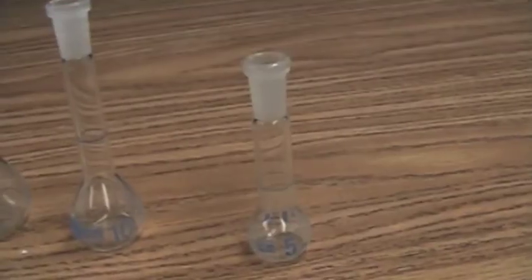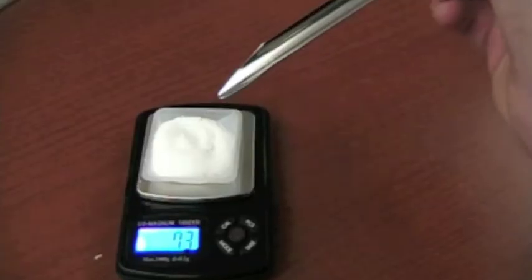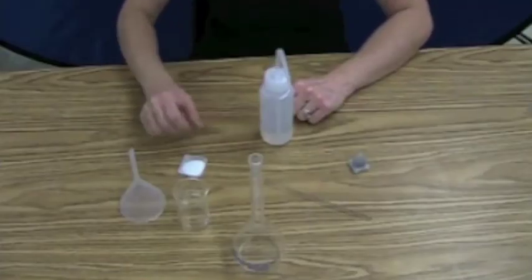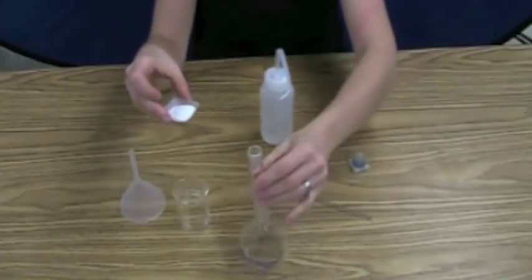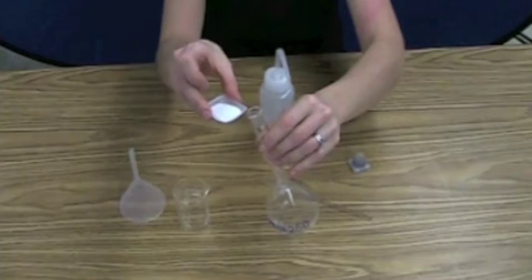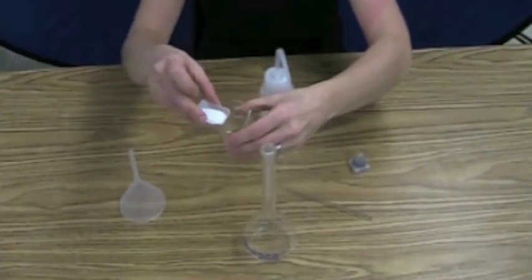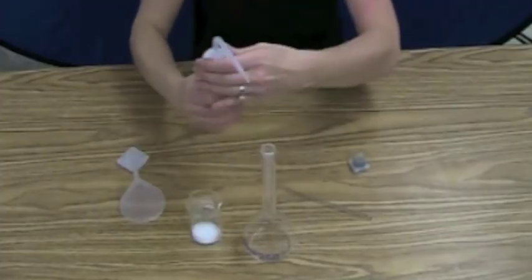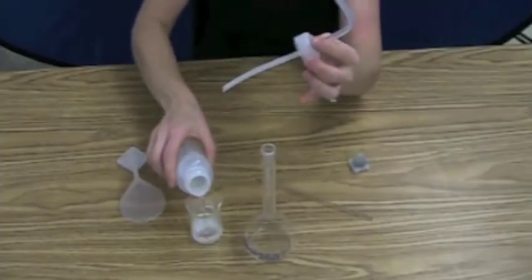The first thing you do when you're making a solution is you measure out how much solute you're going to need. Then you have a choice. You can either take that solute and add it directly to the volumetric flask, but sometimes that's difficult to get a powder into that tiny opening. So the other option is you can put it in a beaker, and then you can dissolve it in a little bit of your solvent, not all of it, but a little bit, so that you can transfer it to the volumetric flask a little easier.